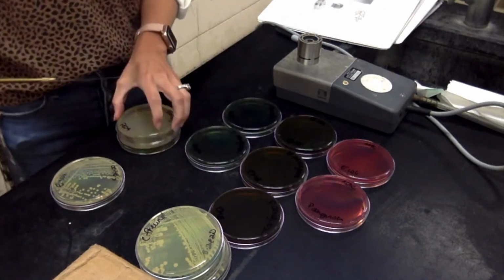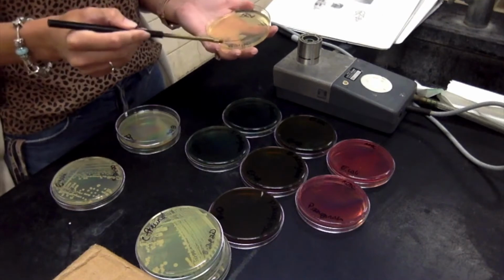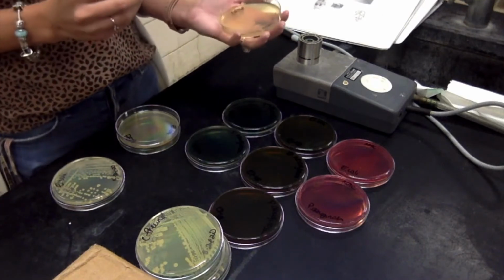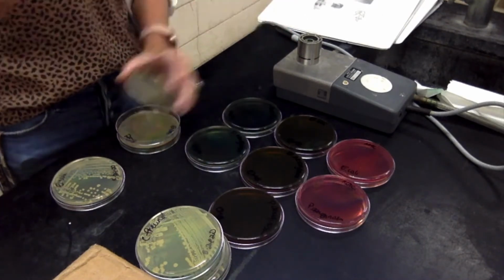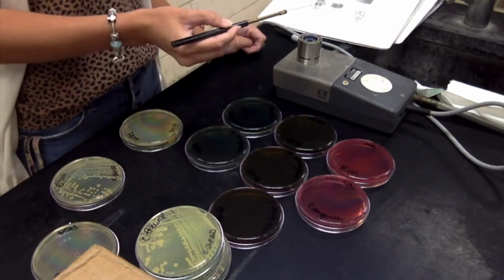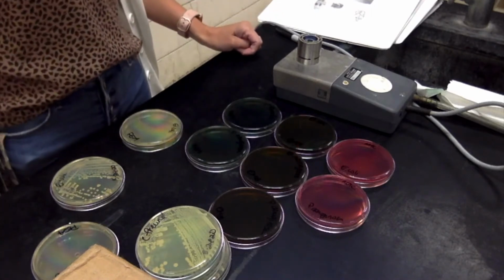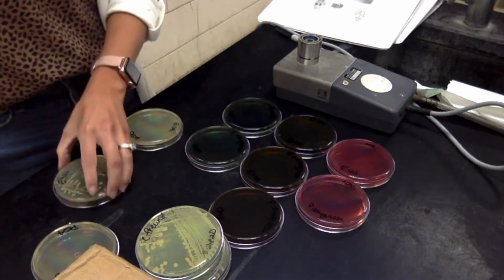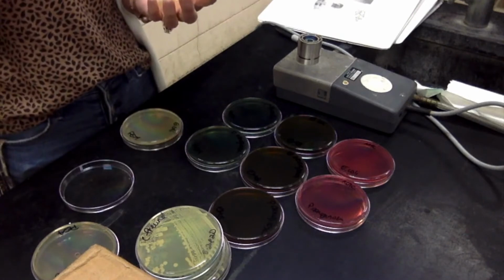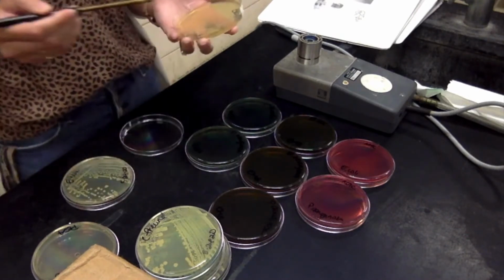One off. That's not good. Alright, so I'm going to finish my streak plate. Okay, there's one. That was my Bacillus. Now I'm going to do my E. coli, which of course for PEA should not grow because it's a gram-negative organism.